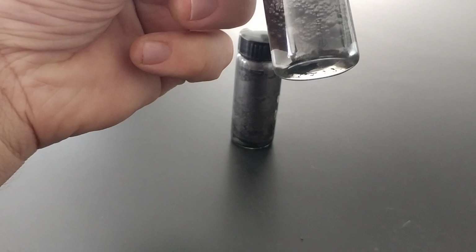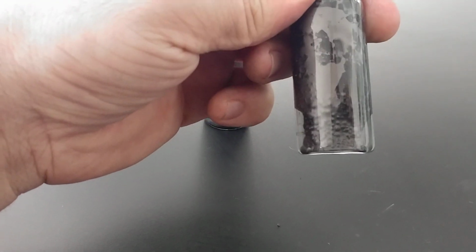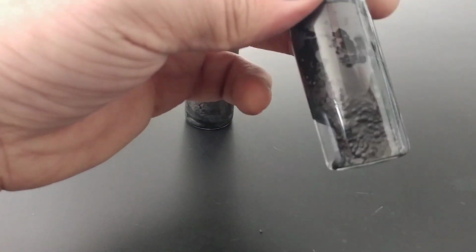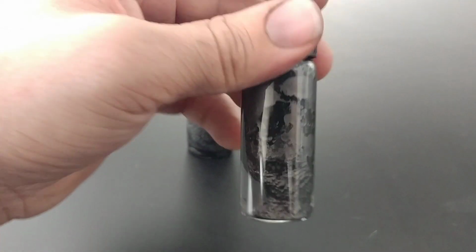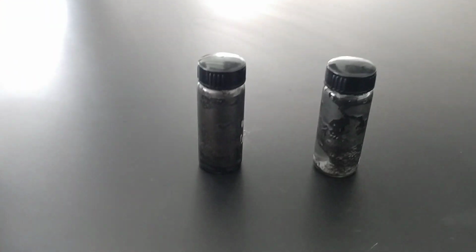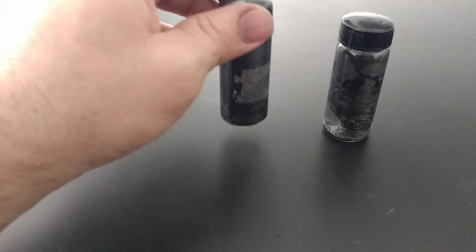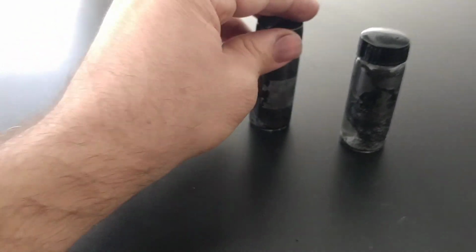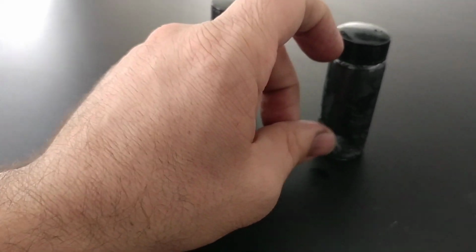And one of the quickest things is, you shake it, and he was saying literally 6 seconds later, bam, you get this. It's actually easier to fool around with the ratios. You can get up to 75% water, oil, or oil water, either way, and you'll see the differences. And you can do your own little experiments, but this will help you guys at least get a start, an idea if you're close, if you're making this stuff. And if you are making a material and some of it's settling out on the bottom and a lot of it's staying on the top, you're getting thin particle layers.